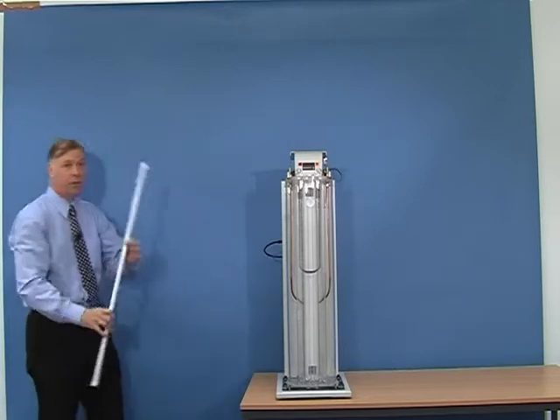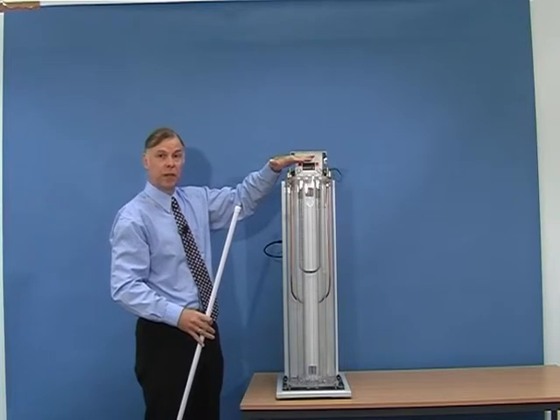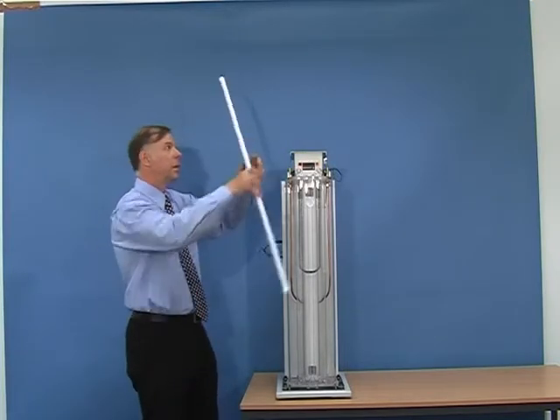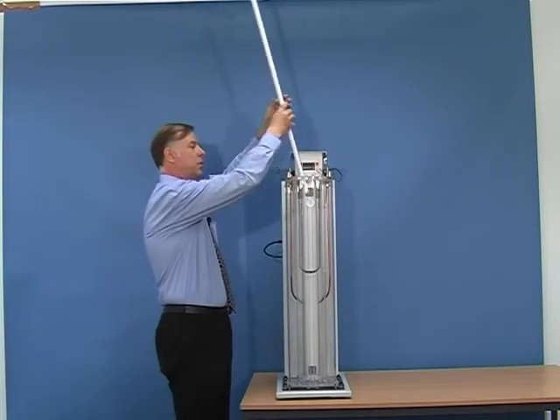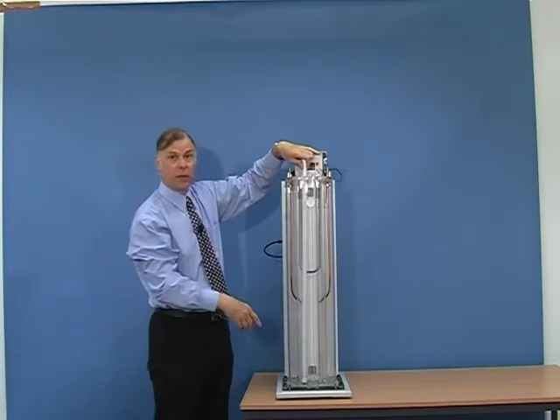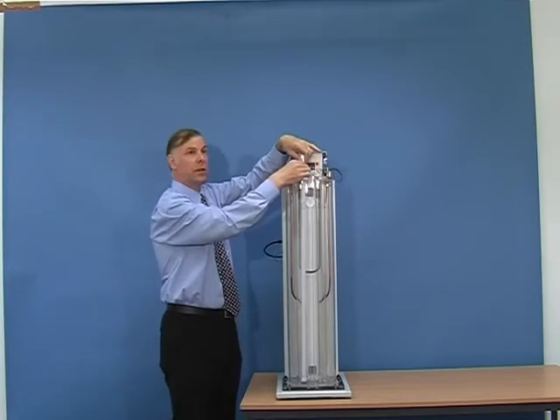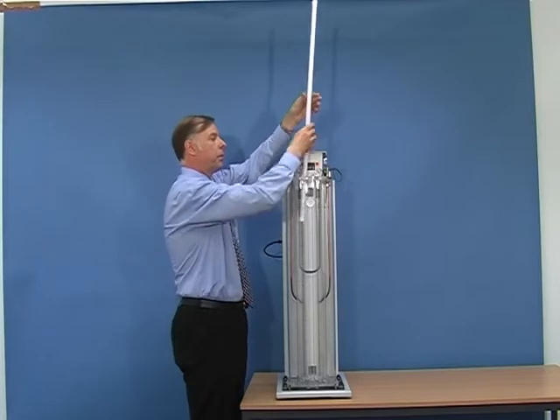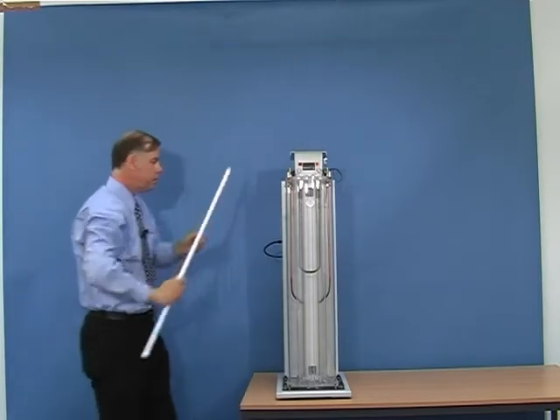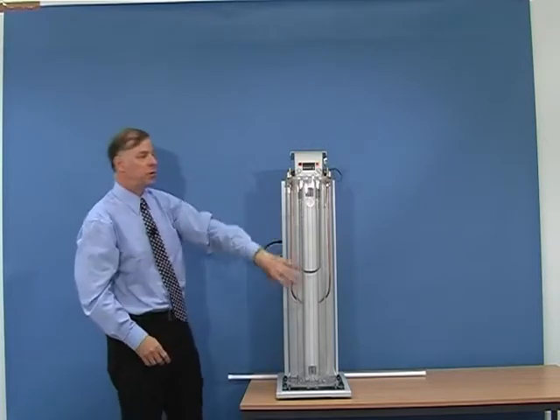We do supply a rod, so that if you find it difficult to hold the pressure against your hand as you push it in, you can use this rod and apply the pressure on the rod to locate the tube into the base. Again, secure it with the clip. Now we have the two tubes fitted into the assembly.